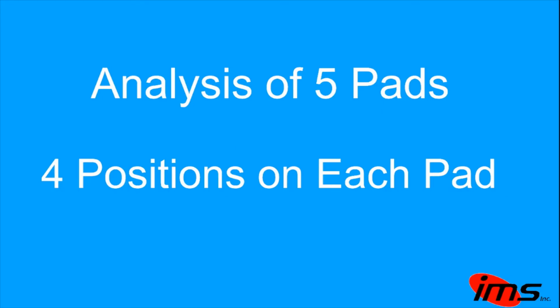In this video, I'll be describing the analysis of 5 pads where we measured 4 positions in each pad. I think I will start out by first describing aspects of the user interface. We'll show some data displays and some user input screen prints. I'll describe those in detail. Then we'll go on to making a measurement and look at the mechanics of inserting the pad and initiating the measurement process. And then lastly, we'll look at the report data.